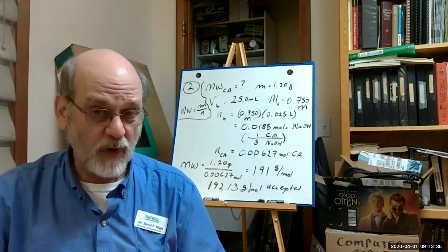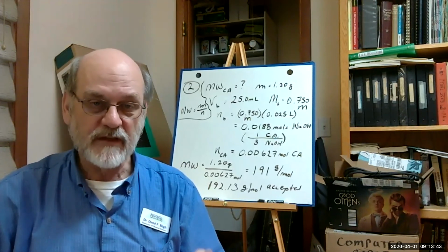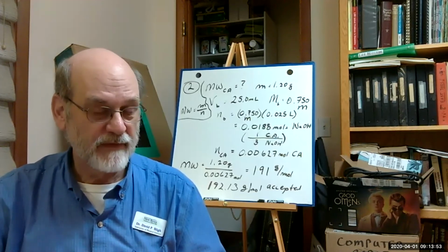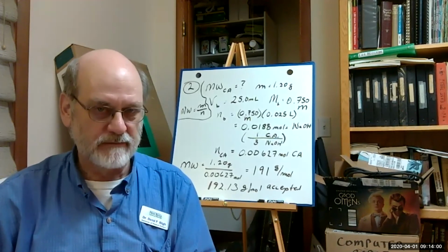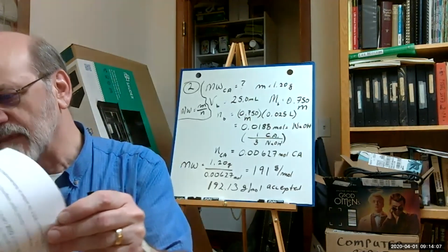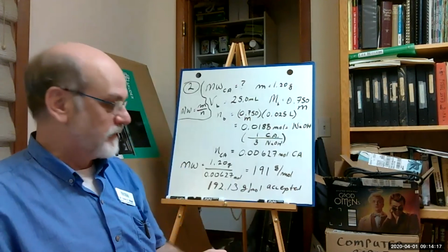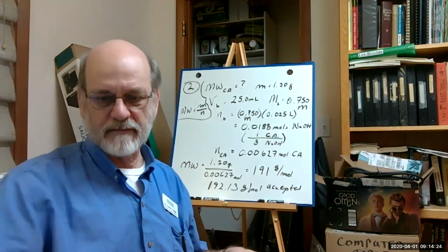And then when you generate your report, remember, one of my pet peeves is when you write the procedure, you write it in third person, passive, past tense. That is, when the method says do this, then when you write your report, you say this was done. All right? And that should give you a fairly decent report, even though you actually didn't do the experiment. But those are the costs of dealing with quarantine.